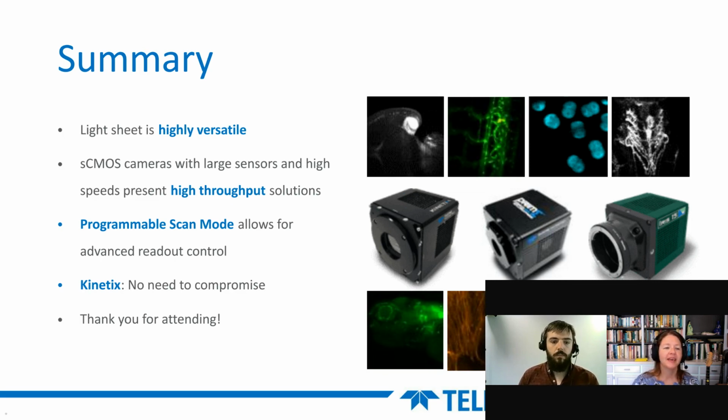Thank you. Next question. Do these cameras connect via SDI or CamLink? What protocol do they use? Does it connect with the NVIDIA Tegra system?